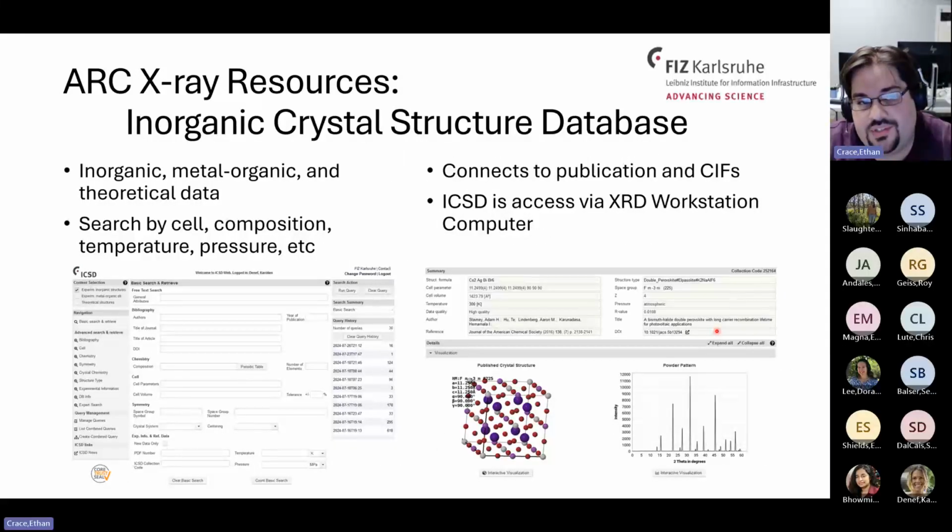In a similar vein, there's the Inorganic Crystal Structure Database, which is sort of the inorganic counterpart to the CSD. You can search it very easily as well. Pull crystal structures much the same way I talked about for the CSD.